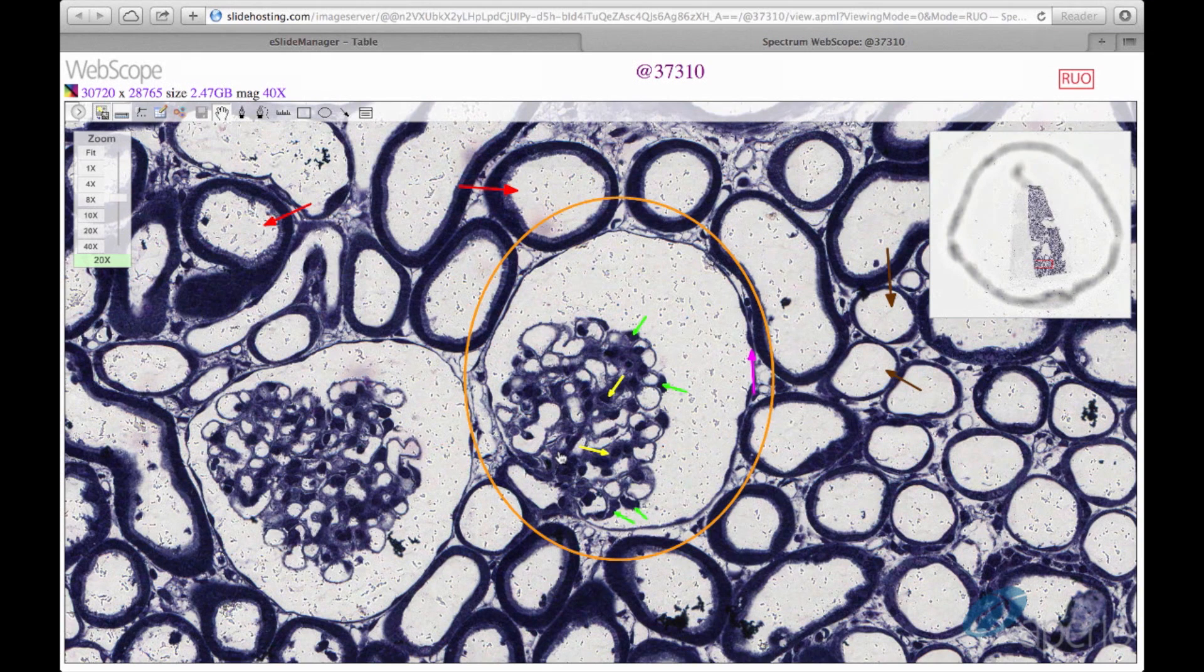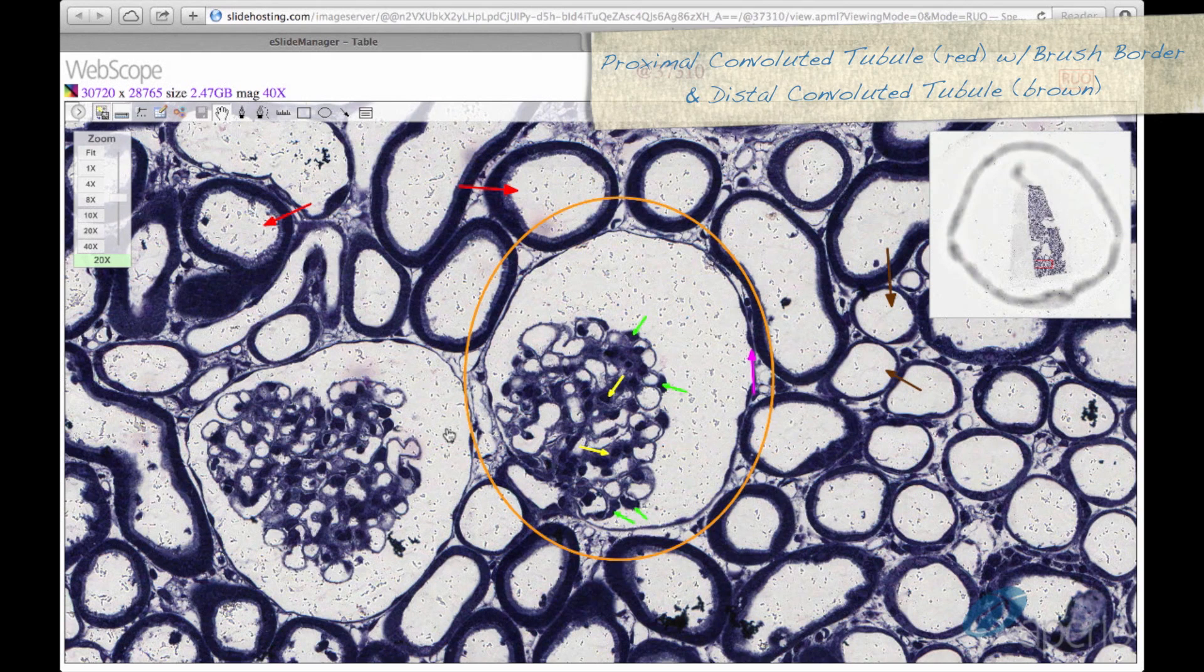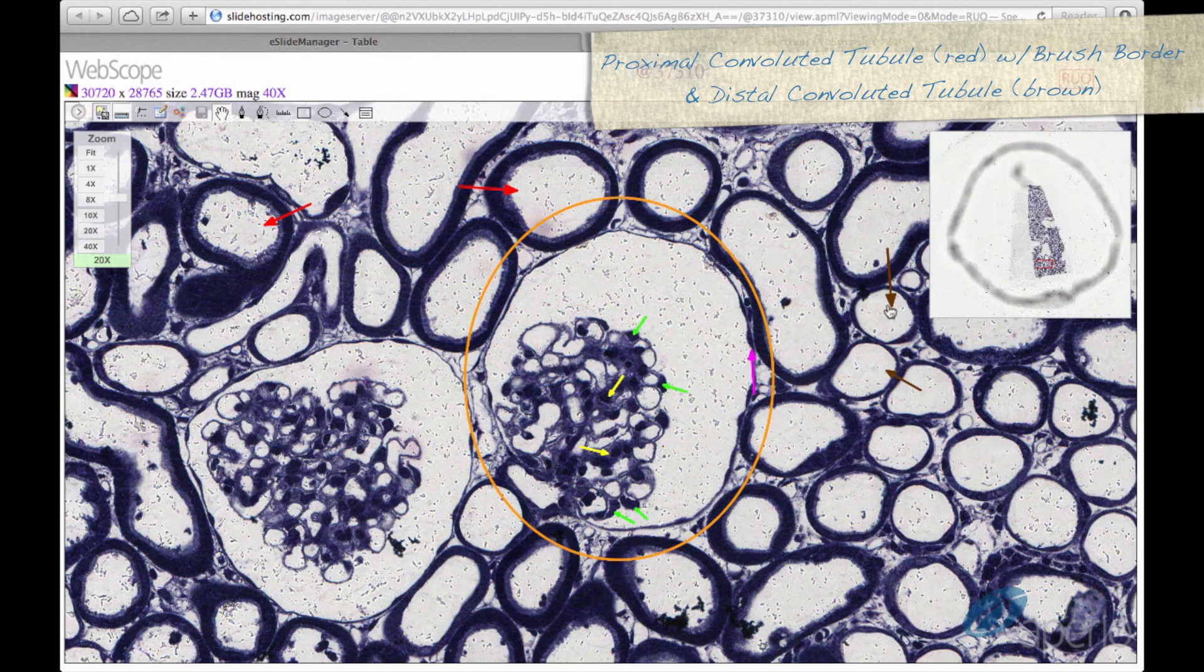Outside of the renal corpuscle, we can again find the proximal convoluted tubules, seen here at the red arrows, and the distal convoluted tubules, seen at the brown arrows. With this stain, we can see the brush border of the proximal convoluted tubule, well preserved.